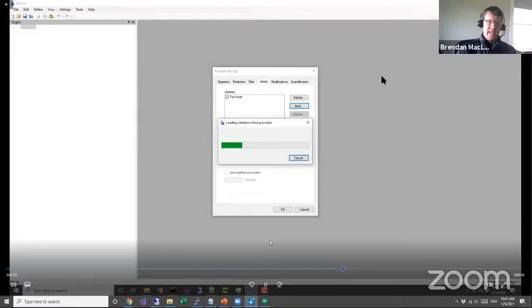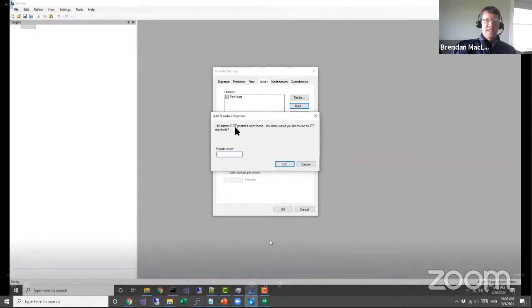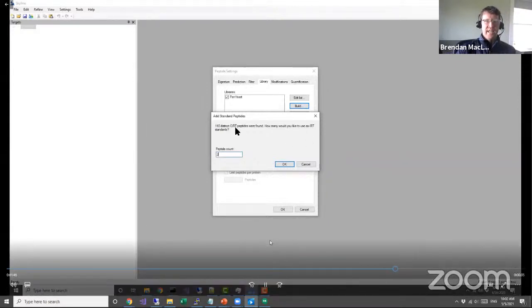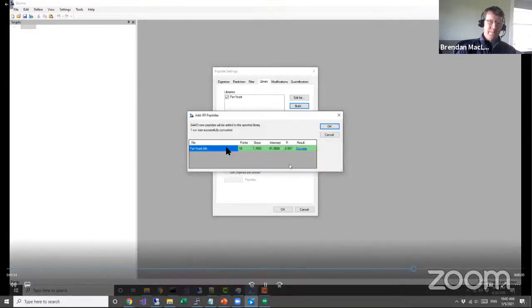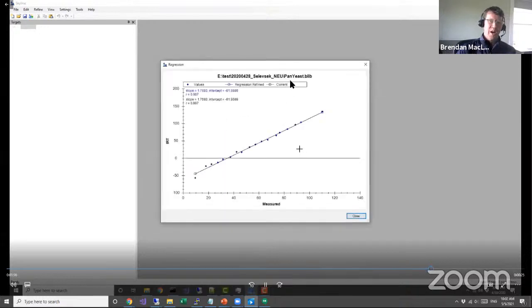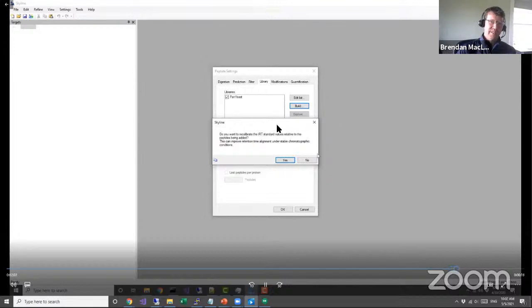And then now it's just doing the retention time processing to come up with a retention time calibration. And so this is building the IRTs. These data, they did inject the IRT standards, but they forgot to search for them. So the search results didn't contain them. So I decided to go with a retention time calibration based on those conserved peptides. So they're not the standard peptides, but you can still create a retention time calibration with those.